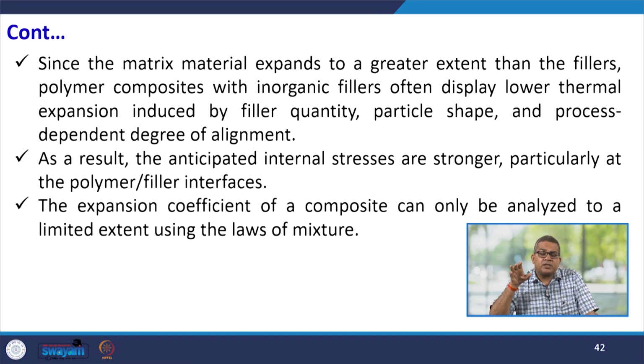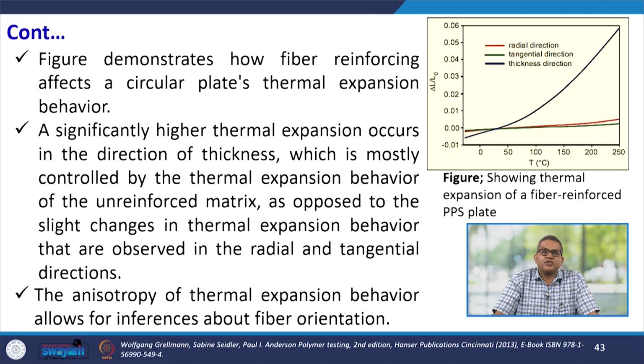Since matrix material expands to a greater extent than the filler, polymer composites with inorganic filler often display lower thermal expansion, influenced by filler quantity, particle shape, and the process-dependent degree of alignment. As a result, the anticipated internal stresses are stronger, particularly at the polymer-filler interface. The expansion coefficient of a composite can only be analyzed to a limited extent using the laws of mixture.